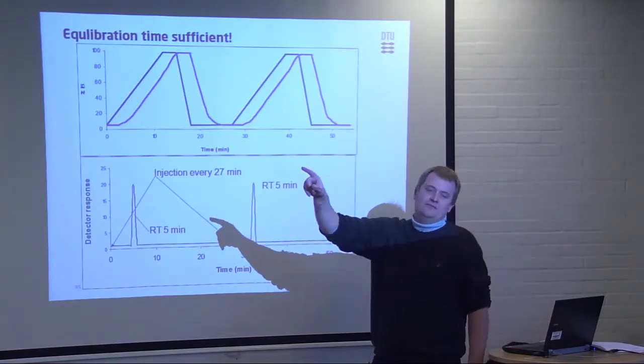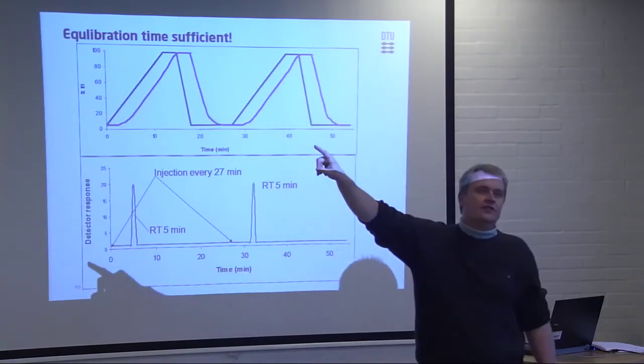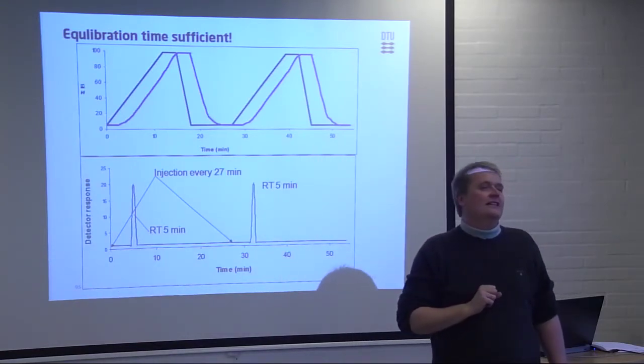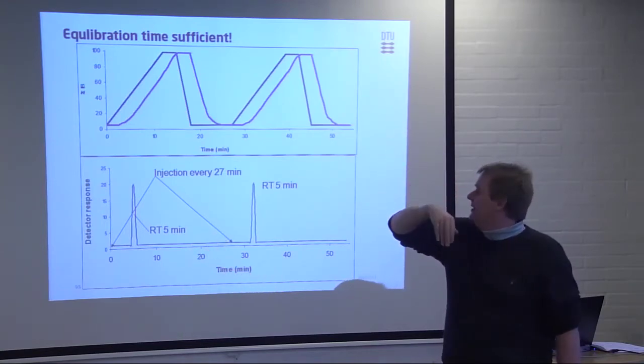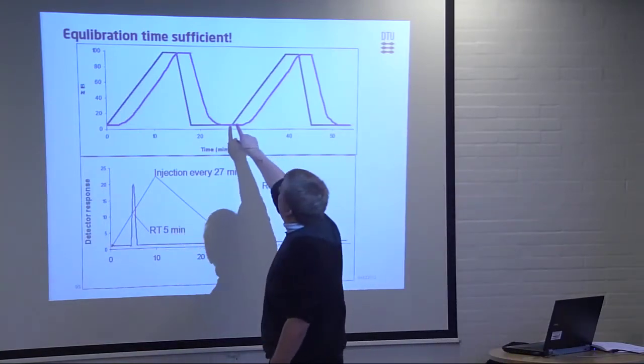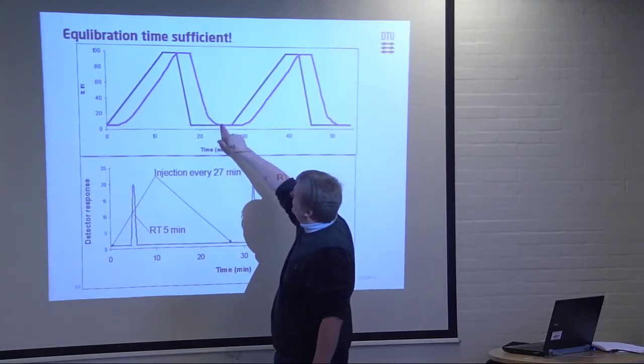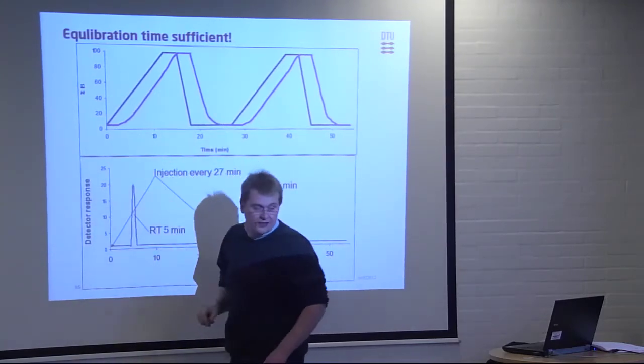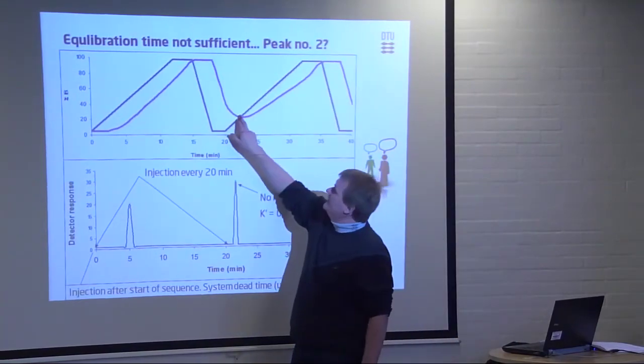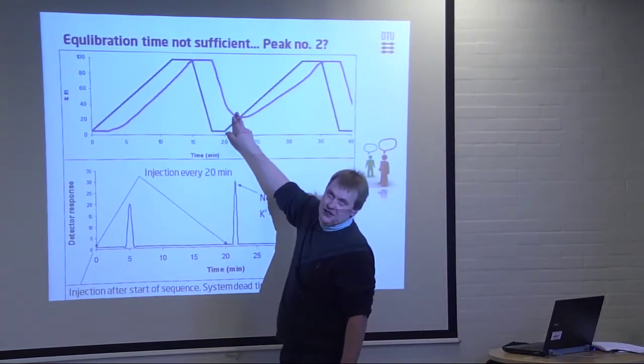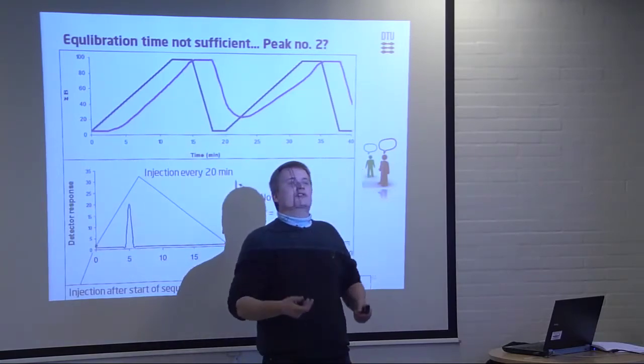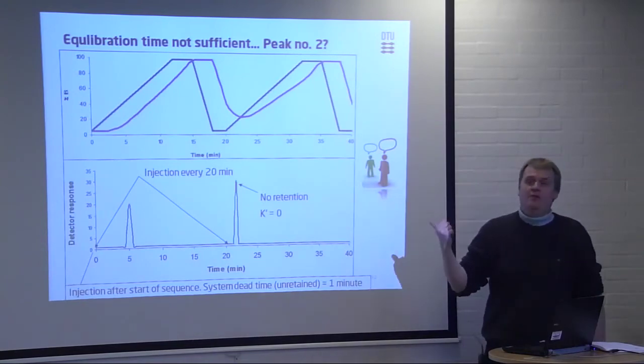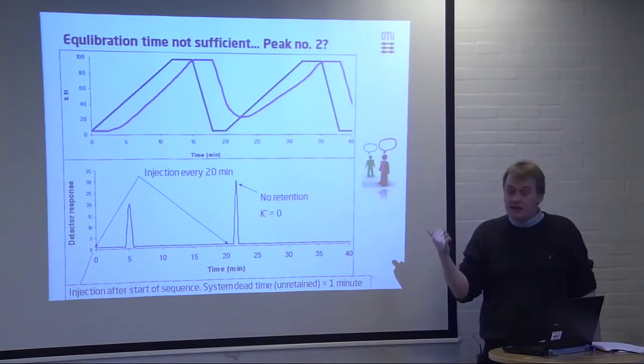You could actually have seen this. You recall the curve I showed you of the pressure of the system. And there you would see the pressure would not really have gone as high, because, you know, when you have the pressure when you're here, should be the same here. So, in this situation, you would have seen that I have a lower pressure, because I actually have more acetonitrile. So, looking at the pressure curves could also have told you this. But this is the most common error I see, and I see it a lot, also with quite experienced people.